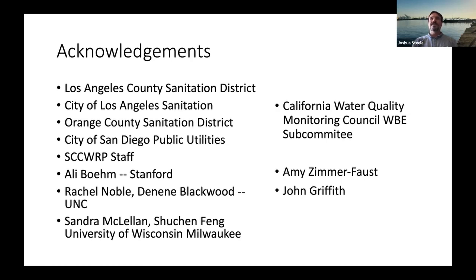What they do is they take, I think, 200 to 500 milliliters, maybe larger, of wastewater, and they put in a large quantity of salt as a preservative, and then they put in a silica milk, and they do the extraction directly on that large volume in the silica, and then they take the DNA from that silica and go into a qPCR reaction with that. So it's a very clever method, and it worked really well, as you can see.